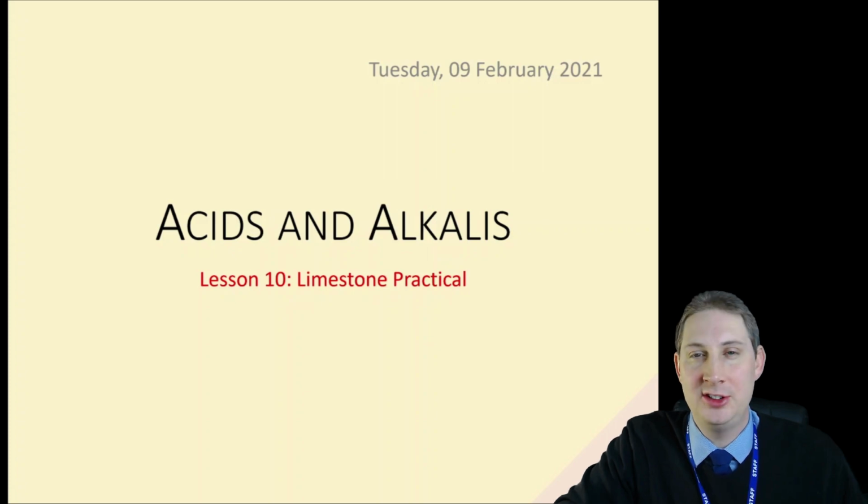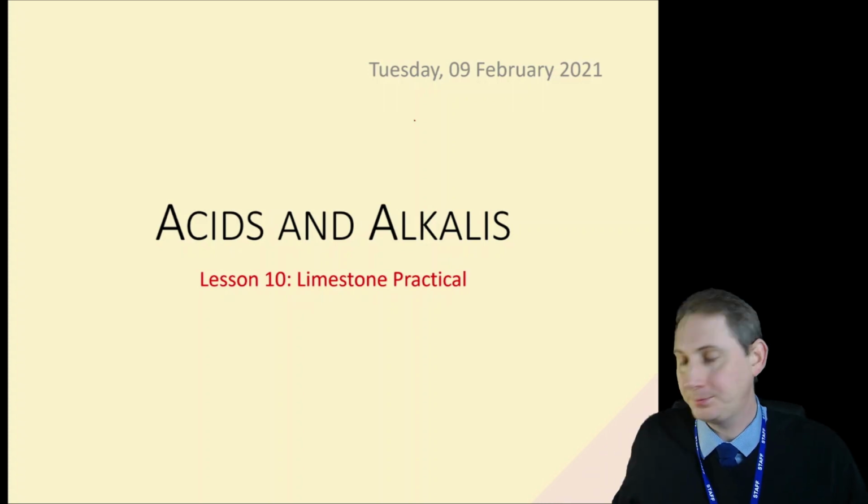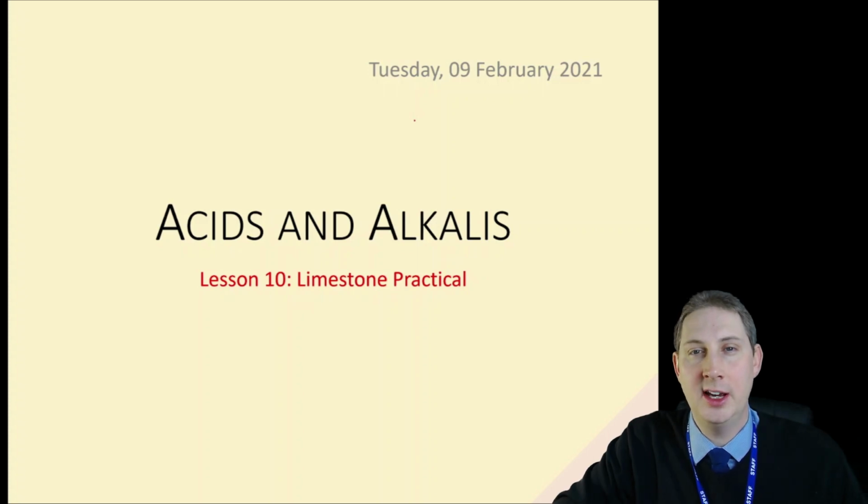But unfortunately, due to lockdown, we can't let you loose in the lab, so we have done the experiment for you and you are going to write up based on that. So watch the video, take notes if you need to, and then be prepared to write up this experiment as done by Mr. Reeves and Miss Richardson.